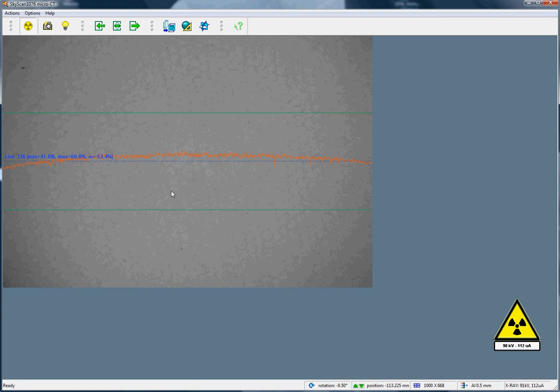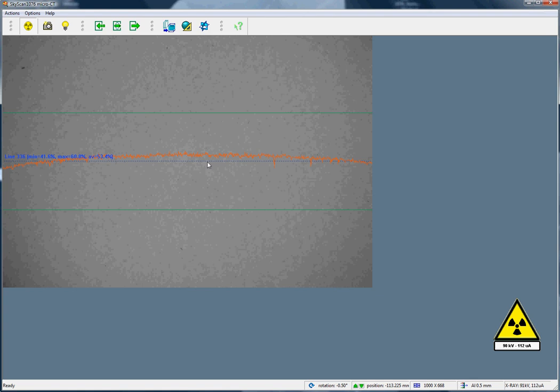Again, it's very important to understand that when we talk about this 50% intensity, we're talking about the empty and uncorrected image. Please do not confuse this with the corrected image with the image in the field of view. In such an image, the percentage can be a wide range of values and doesn't have to be adjusted.